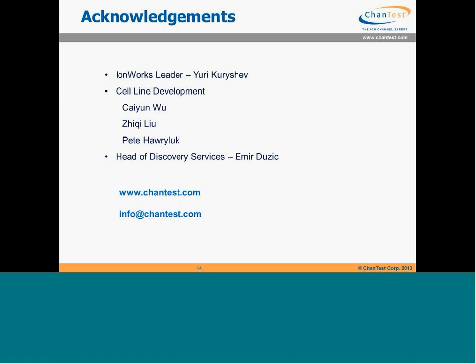Okay, thank you. That's especially interesting. I hadn't heard of NMDA receptors on Barracuda before, so it's good to hear that looks promising. My second question is, have you tried using barium as a charge carrier for the calcium channels?